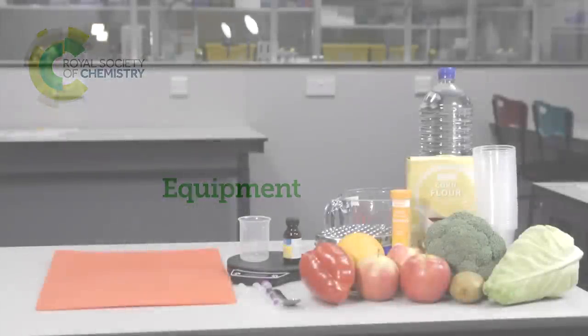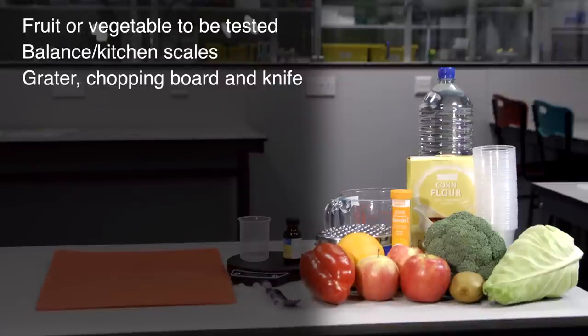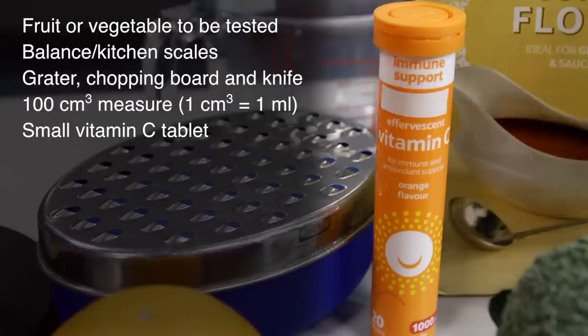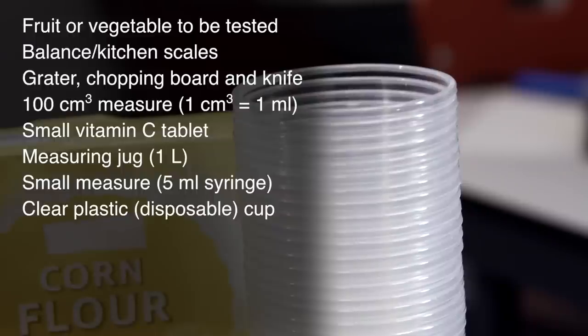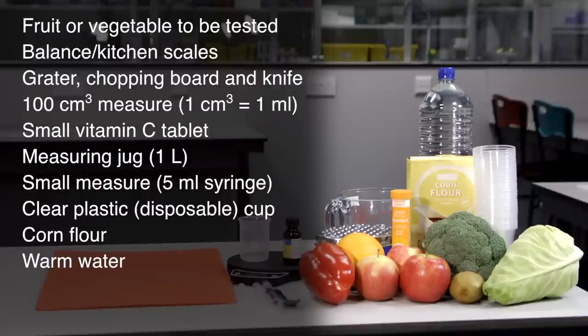So the equipment you'll be needing to take part in the global experiment is the fruits or vegetables to be tested, balance or kitchen scales, a grater, a chopping board and a knife, a 100 centimetres cubed measure, a small vitamin C tablet, ideally an effervescent one, of about 1,000 milligrams, but as long as it's a known weight, a measuring jug, up to 1 litre, a small measure, something like a 5 milliliter measuring syringe, or perhaps a teaspoon, a clear plastic disposable cup, corn flour, which is your starch solution, some warm water, perhaps from a kettle or a hot tap, tinctures of iodine, and pipettes or an eyedropper.